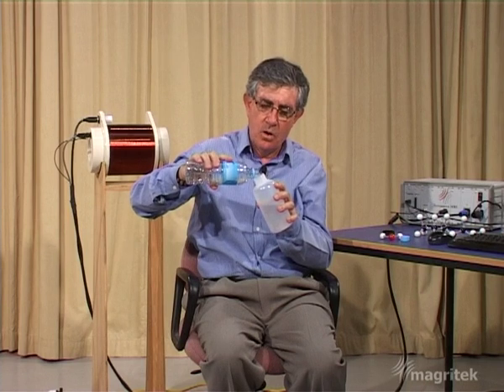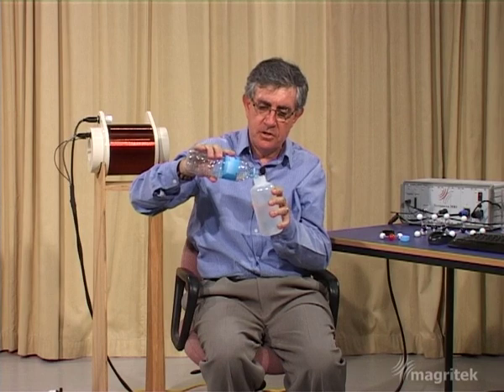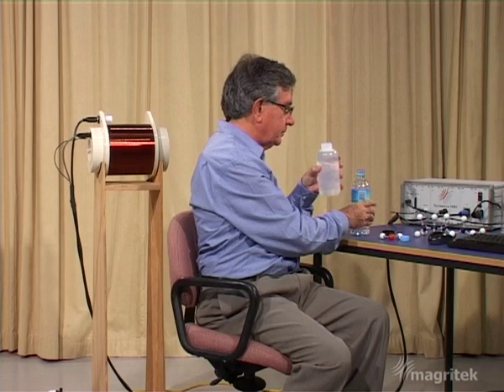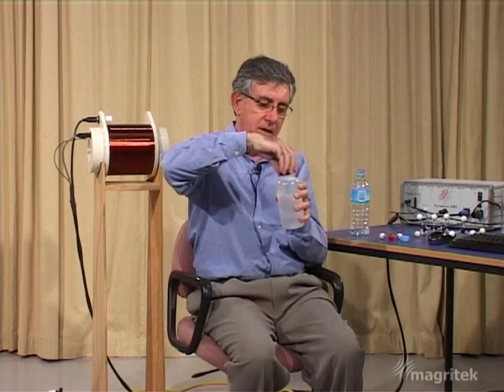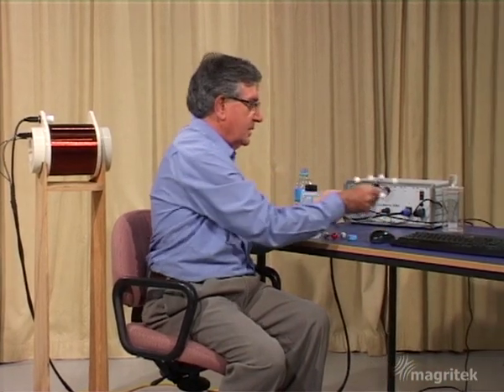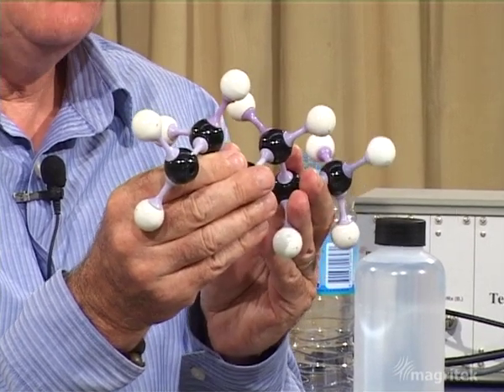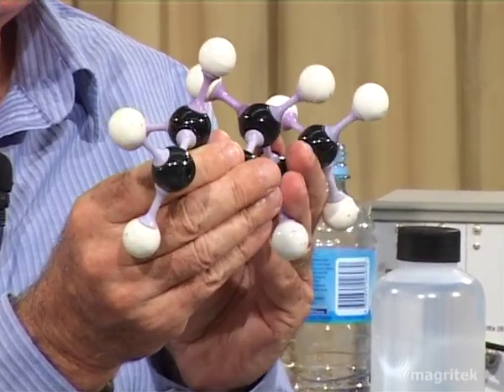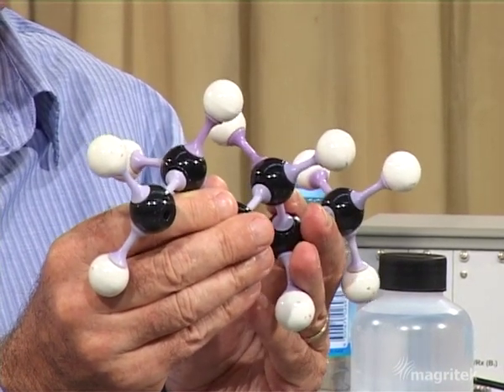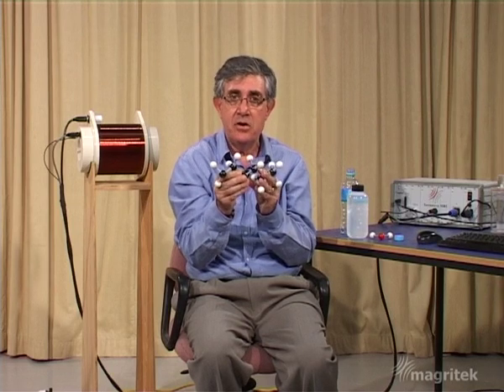By the way, water is not the only material that one can perform nuclear magnetic resonance experiments on. There's lots of other molecules around that contain plenty of hydrogen. For example, I've got sitting over here a very different sort of molecule. It's an aliphatic chain, such as you might find in one of the lipid molecules in your body. Lots of carbon and lots of hydrogen. In fact, any material that contains hydrogen, particularly when it's in a liquid form, is really quite suitable for carrying out a nuclear magnetic resonance experiment in the Terranova apparatus.